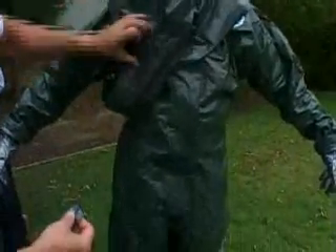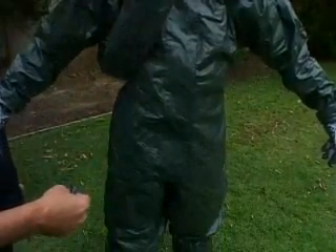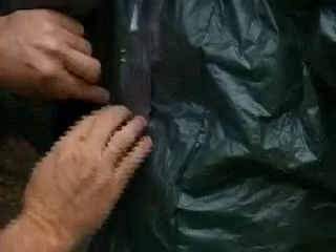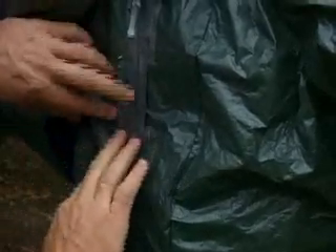It is important to seal all seams with tape, according to the manufacturer's instructions. We're ready to start.